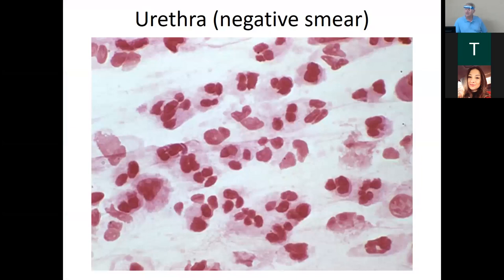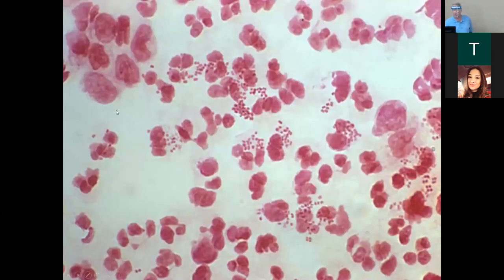And they go, well, some gram negative. I'm not real sure. It's been a while. That's the go-to answer when you do the clinical review. It's been a while, Mr. Director, since I've had the class. And then when I put this one up there, they go, oh yeah, now I see it. Now I see all the little diplococci. Is that gram negative again? Yes, right? So you see these neutrophils eating the diplococci there.